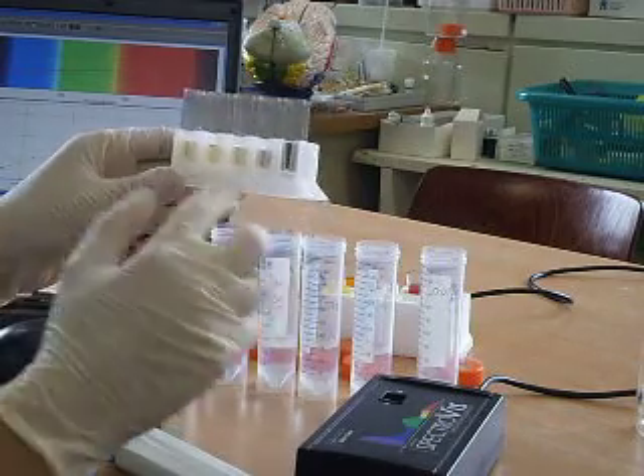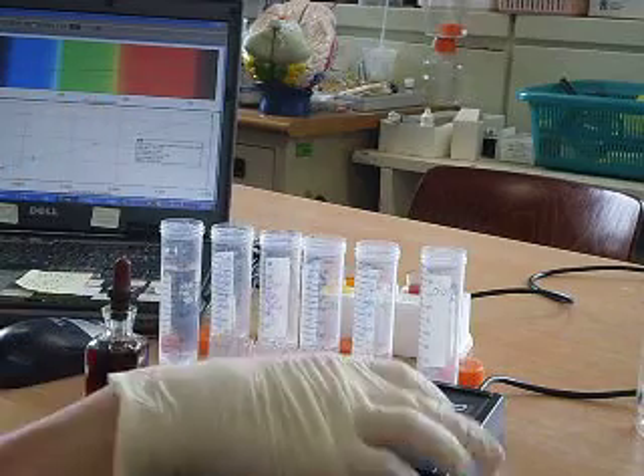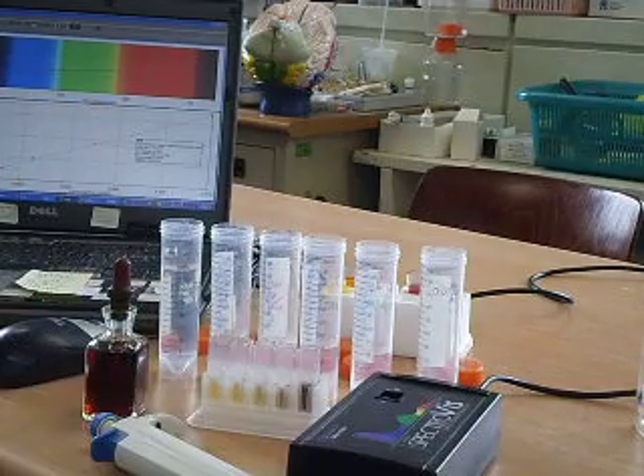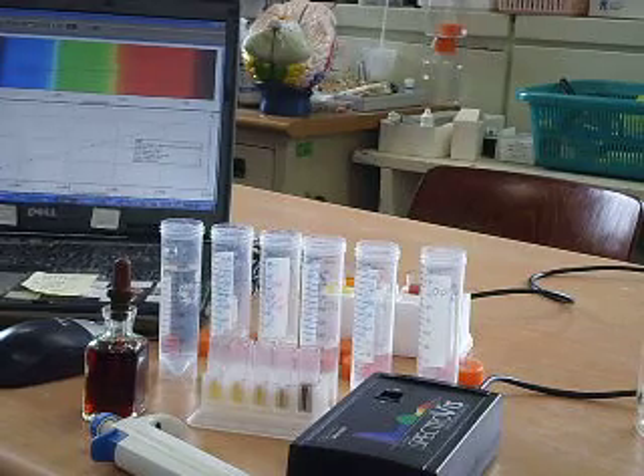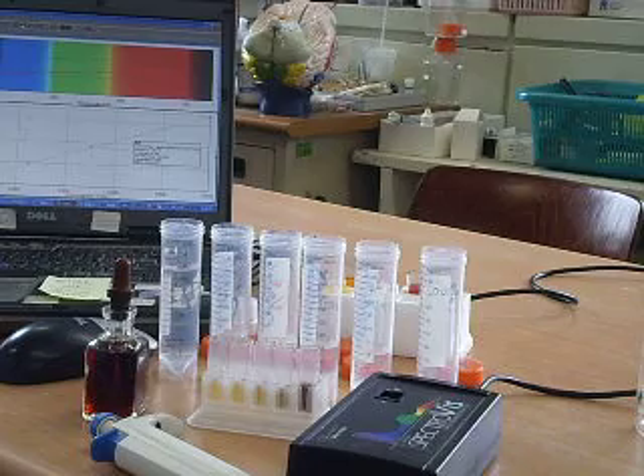this is the 5 different solutions, and I'm going to quantify them using a visible spectrophotometer at 567 nanometer wavelength. This is my standard calibration at 567 nanometer.